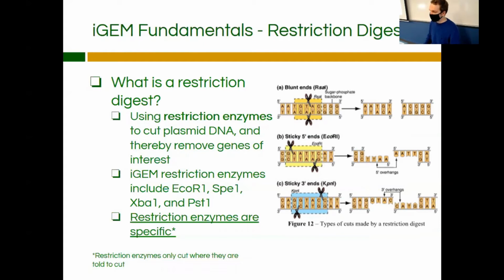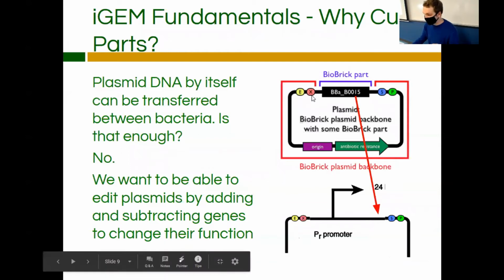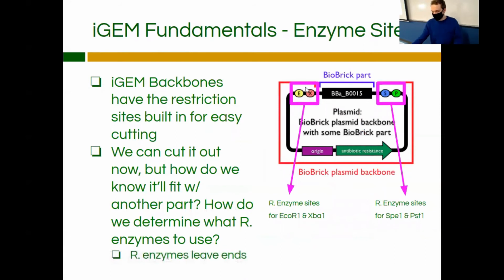So the goal here is, in your backbone, these are the sites that they find. Your goal is to cut them there. So yeah, these are the restriction enzyme sites. The E stands for EcoR1, likewise for the other ones. And the iGEM backbones have these sites built into them for easy cutting, so we can just move parts and attach parts easily compared to just going into nature and having to add a bunch of nucleotide sequences to the end of a part in order to make it capable of being ligated together, so glued together.